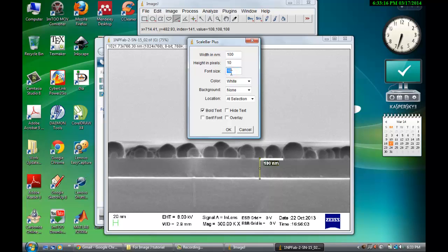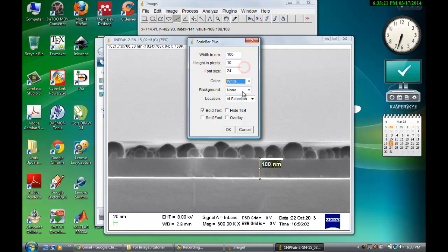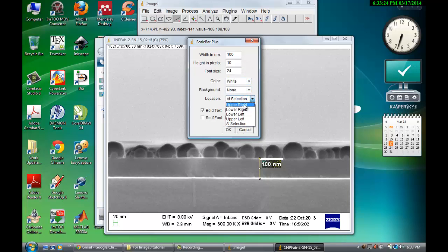The font size you can make 24, 23, whatever. Then you can choose the color and then background and then location. So let's say you want to put it at upper right. Okay.